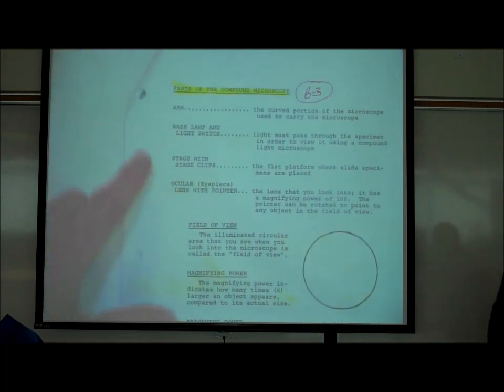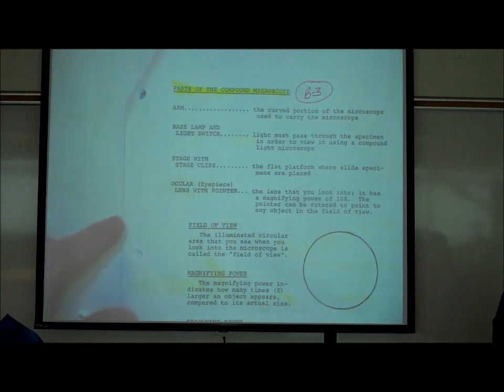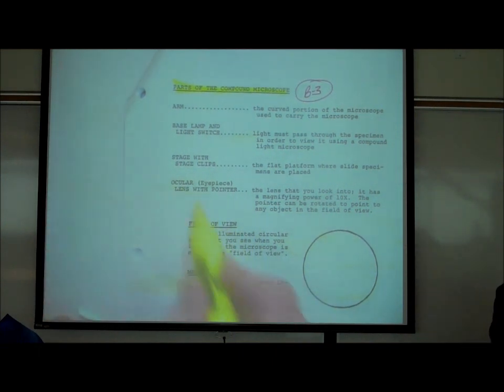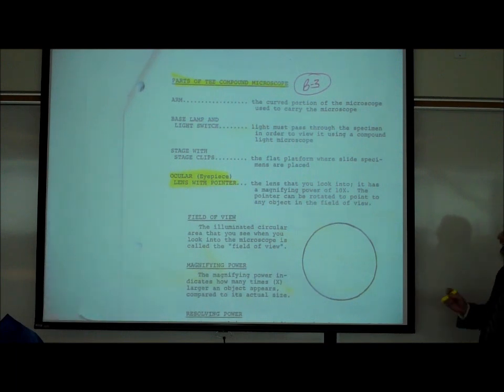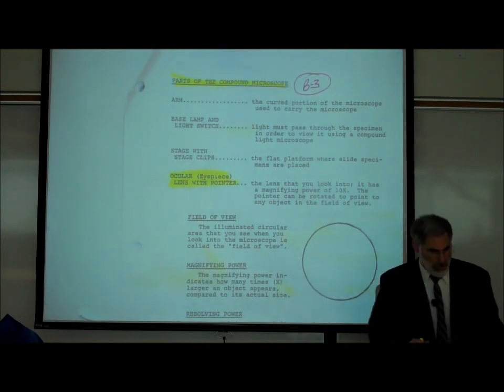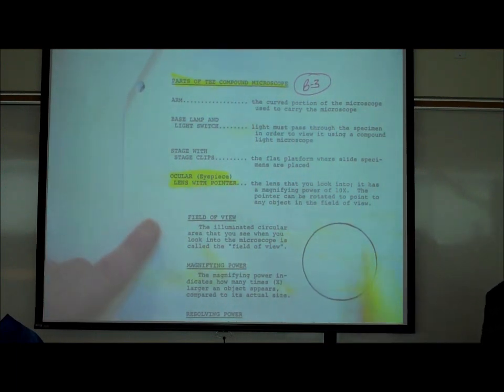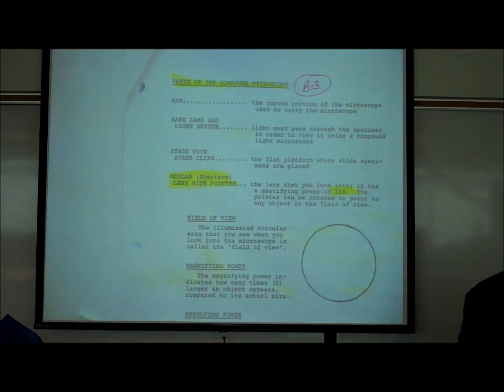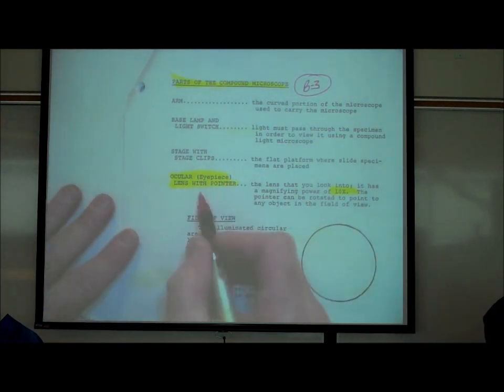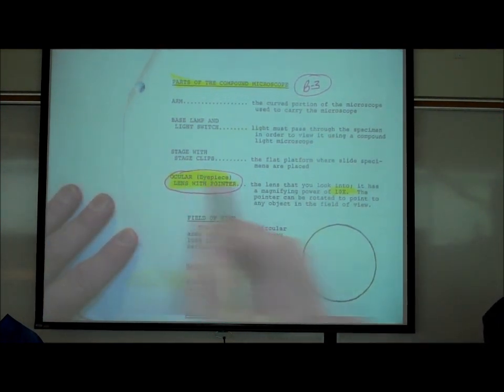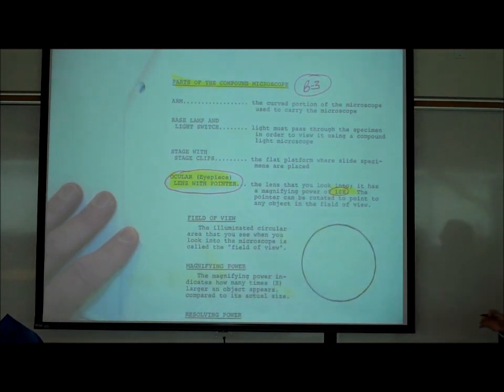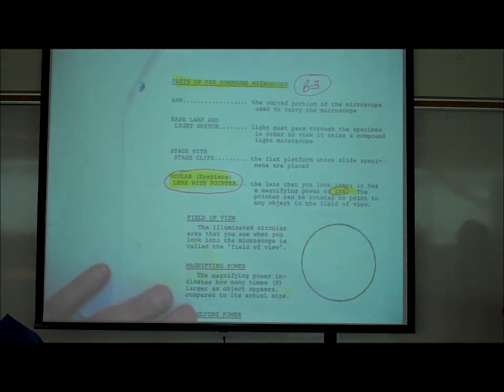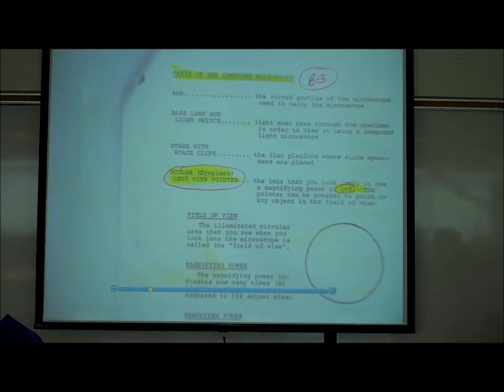We've mentioned the arm, the base, lamp, and the stage. The ocular or eyepiece lens has a magnifying power of 10x, meaning if you were using this lens alone, it would make whatever you're looking at appear 10 times bigger than it really is.